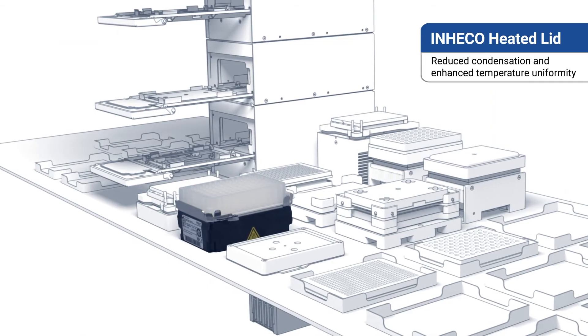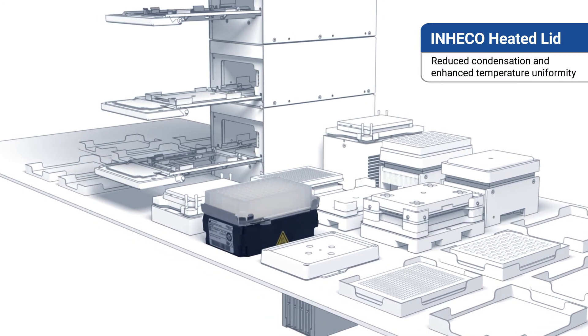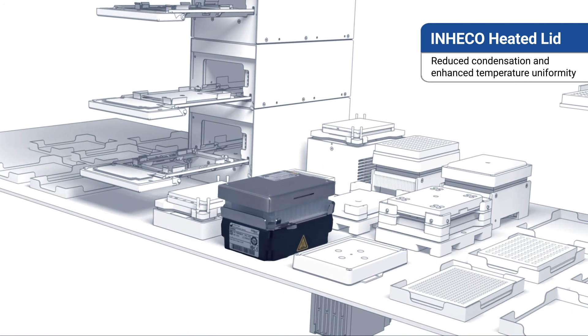Custom designed to both reduce the impact of condensation and to further enhance temperature uniformity, the INHECO heated lid can be added to the HEATPACK.